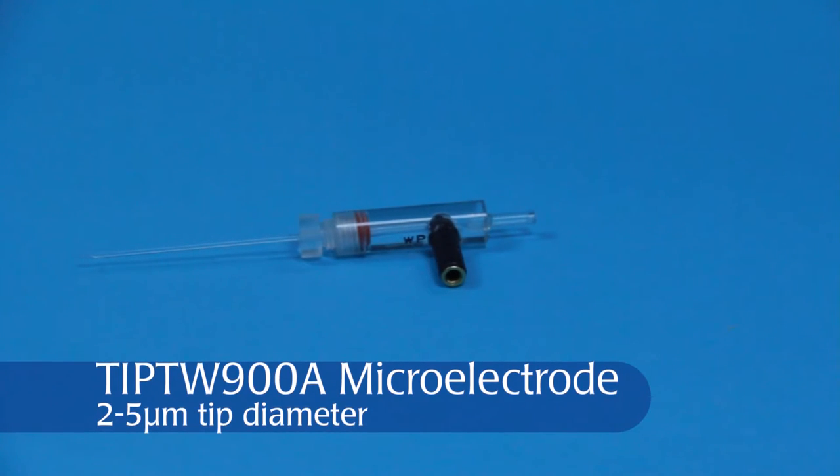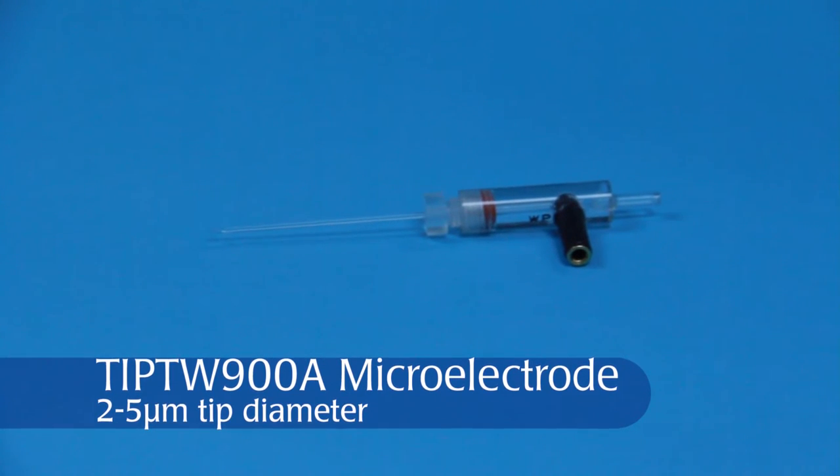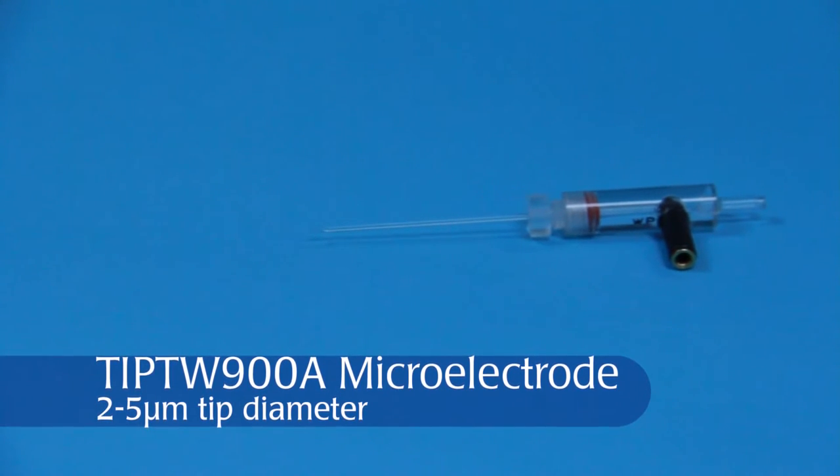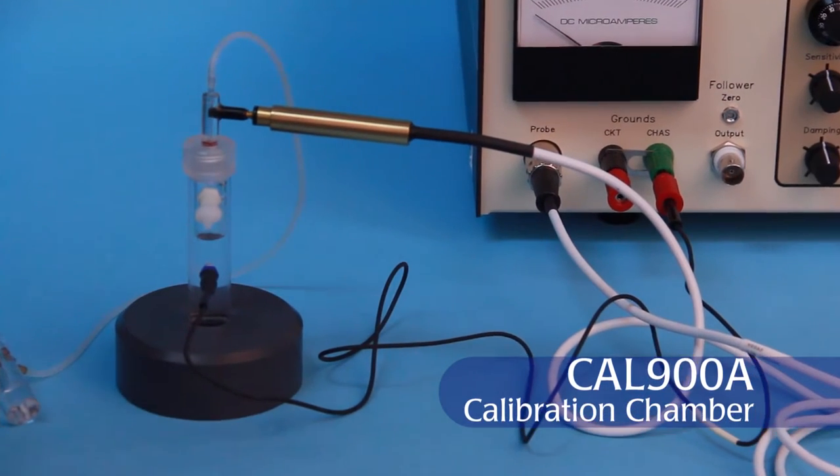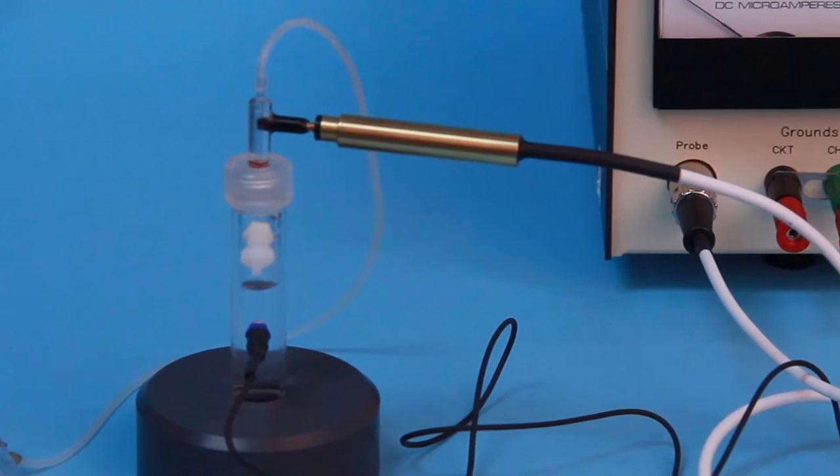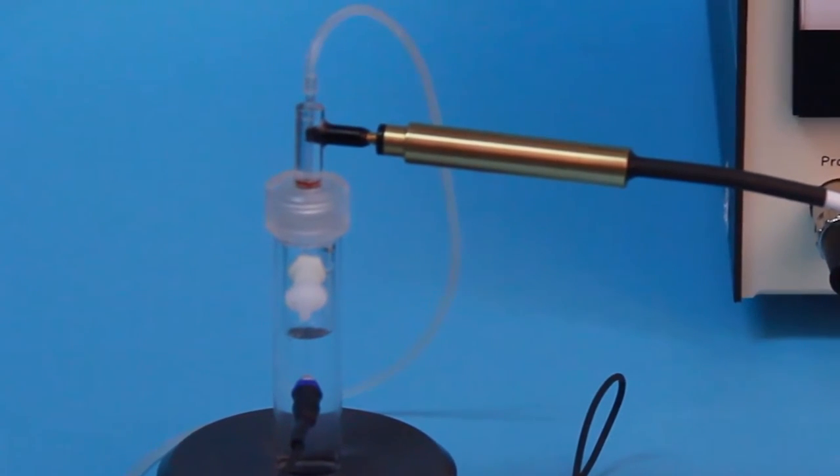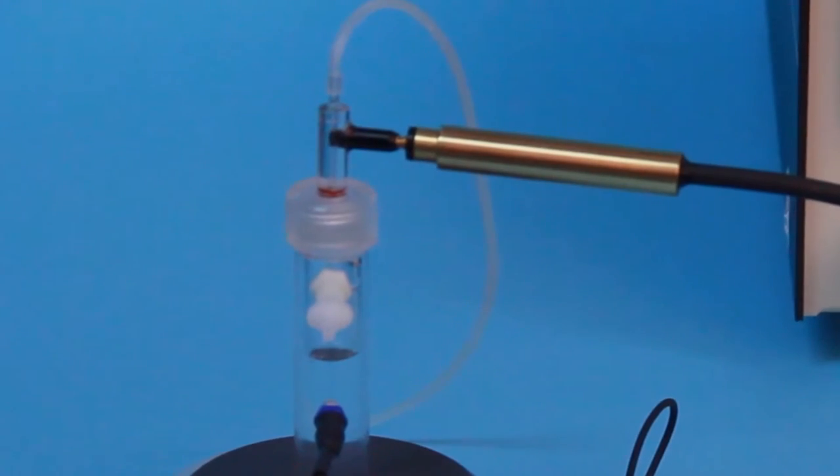The system's sensing element is an electrolyte-filled glass microelectrode with a tip diameter range of 2 to 5 microns. Pressures of electrolyte solutions are measured by maintaining a salt concentration gradient at the tip of the sensing electrode in dynamic equilibrium by applying an equal air pressure inside the microelectrode.